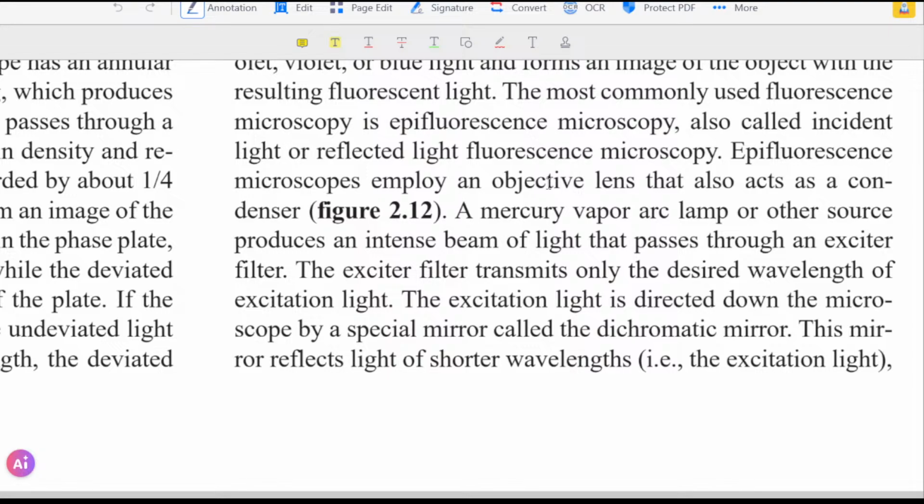Condenser means, of course, they condense all the light that is splattered around here and there, because it is reflected light. The reflected light doesn't know where it's going. It only reflects because of the density of the object. The denser the object is, the more drastic the reflection will be.